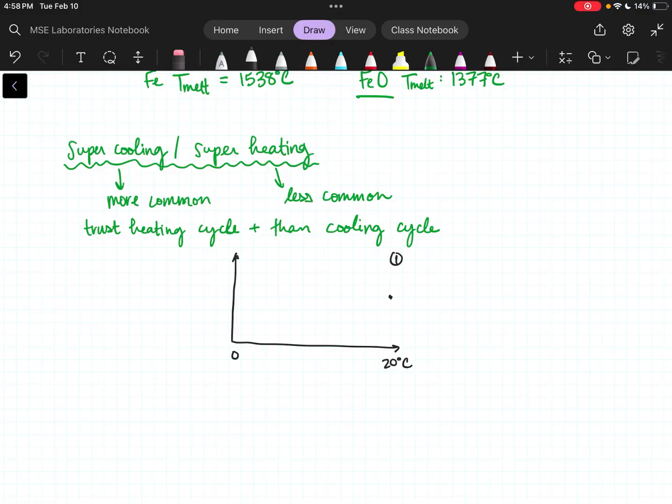I'm going to have to take the instrument down. We'll do it this way. And I'm going to see that freezing occur at whatever temperature this happens. 0 was a bad example, but let's say I have something that freezes at like 10 degrees Celsius here. So I am first going to cool down. Then, and we will use another color, I am going to turn the temperature around and heat the sample and see it melt.